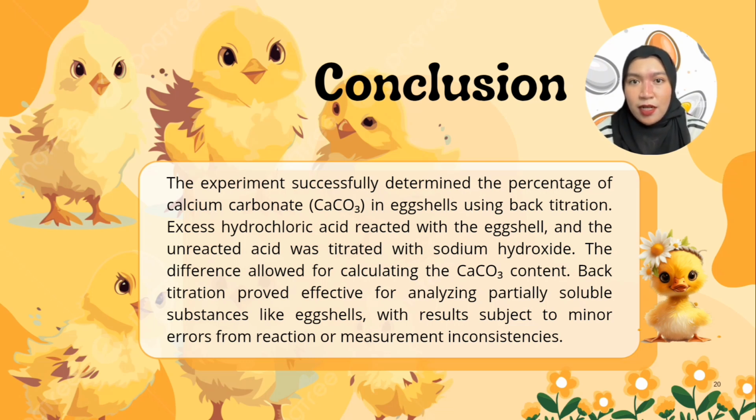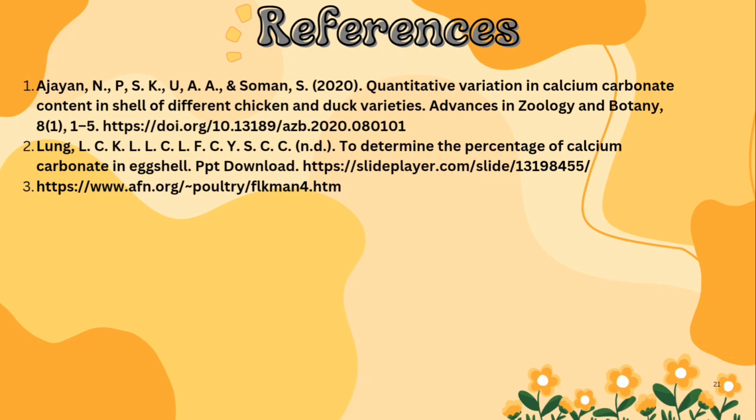The excess hydrochloric acid reacted with the eggshell, and the unreacted acid was titrated with sodium hydroxide. The difference allows for calculating the CaCO3 content. Back titration proved effective for analyzing partially soluble substances like eggshell, with results subject to minor errors from reaction or measurement inconsistencies.